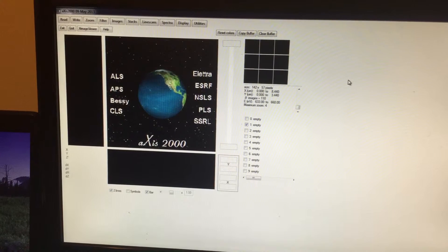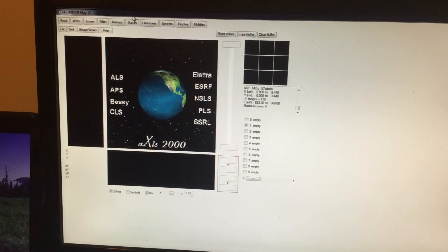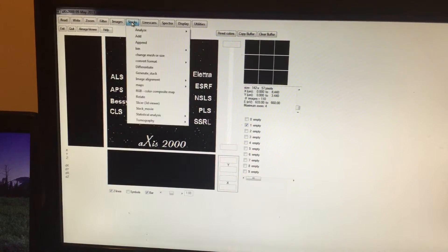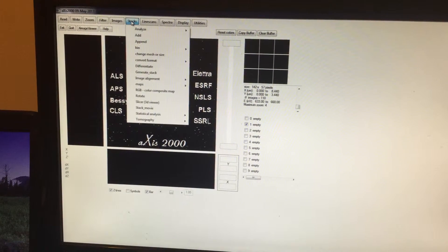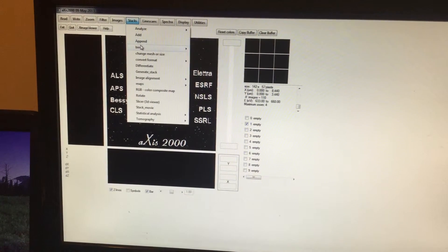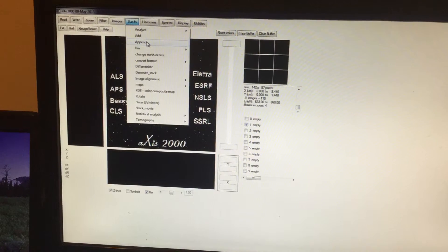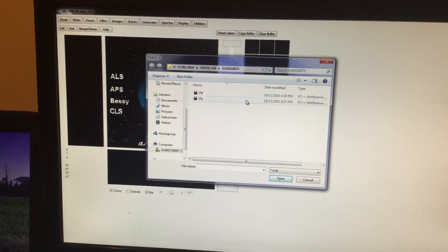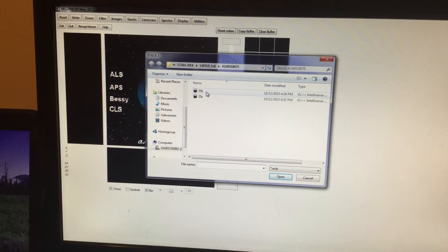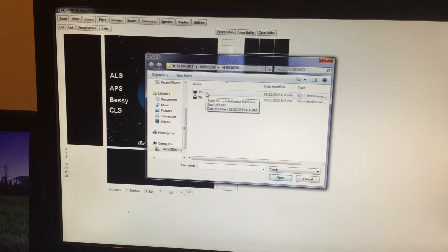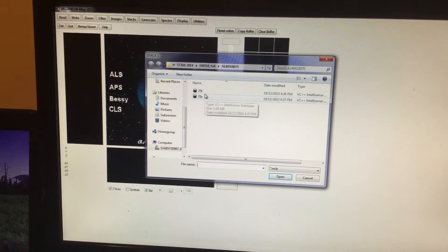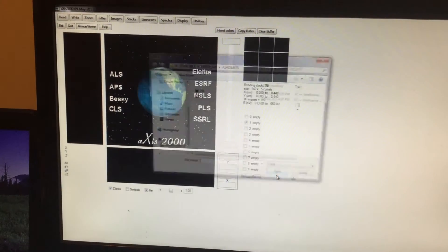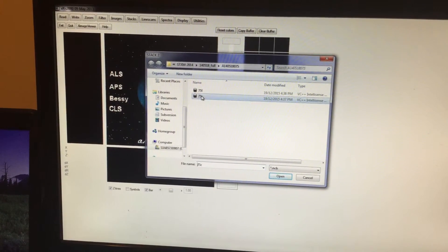Click on Stacks. To do that, click on Stacks, and you can see here a number of options: Analyze, Add, Append, Bin. We have to append, therefore click on Append. You can see here two files that we saved just now: 75L and R. I'm going to click on L, and second file, which is RCP, 75R. I'm going to click on that.